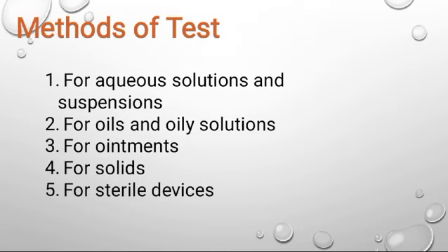Methods of test. First, for aqueous solutions and suspensions. Second, for oils and oily solutions. Third, for ointments. Fourth, for solids. Fifth, for sterile devices.